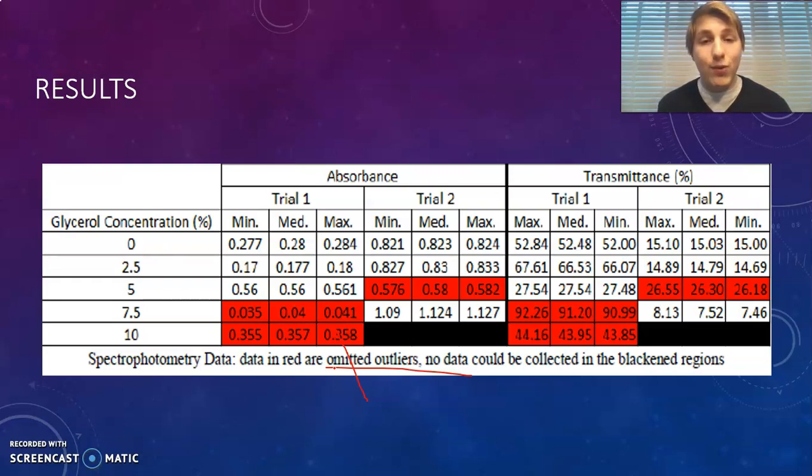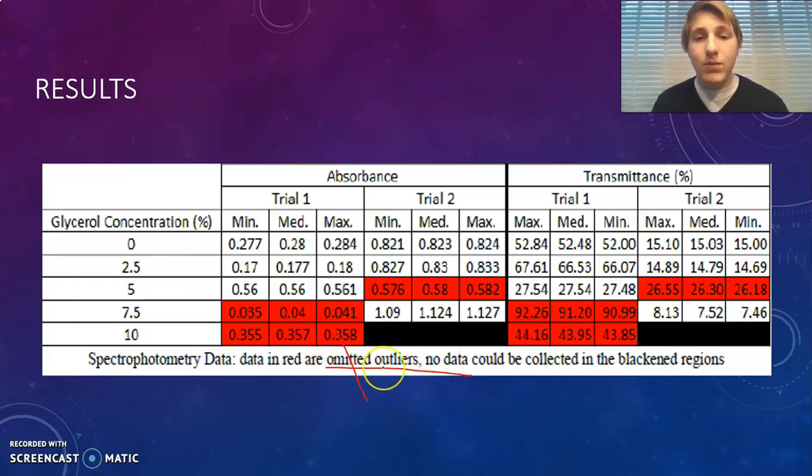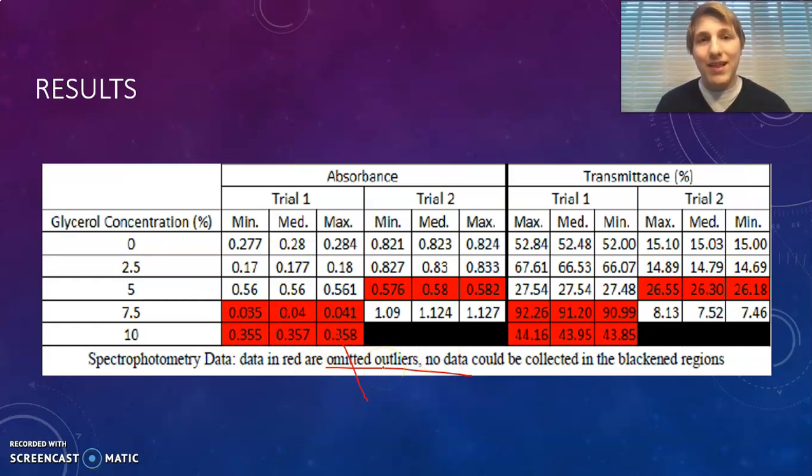And so in my final statistical analysis, I omitted the tubes where I could visibly see unstained chunks of biofilm floating in the media, and it was kind of a big mess. So I omitted those, but I still wanted to include them to show some of the hardships that I had to overcome in this experiment.